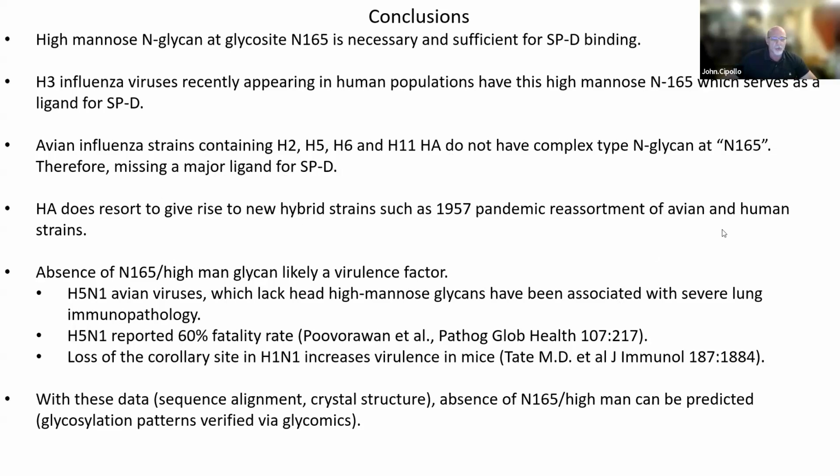So HA does resort. So knowing this probably gives us an awareness of how pathogenic these might be if they do tend to resort. And if you remember back to that 1957 version where we had H2, it's likely that had a complex glycan and may have contributed towards this pathogenicity. Speculating here. So absence of that 165 is likely a virulence factor.